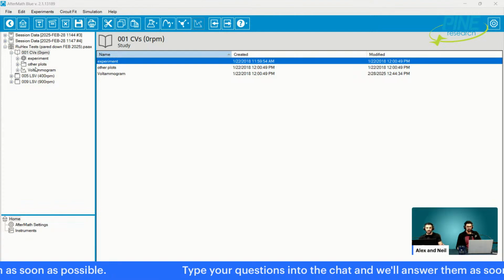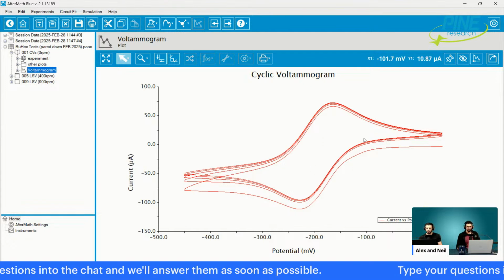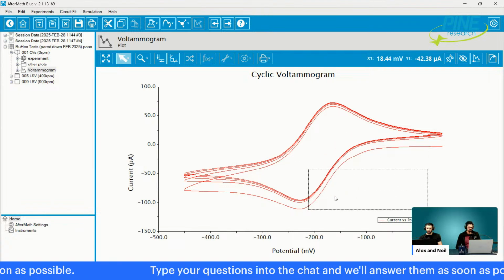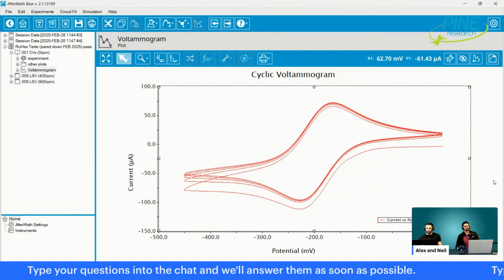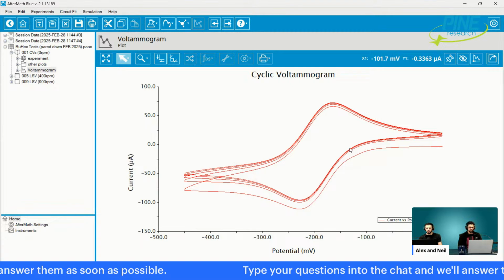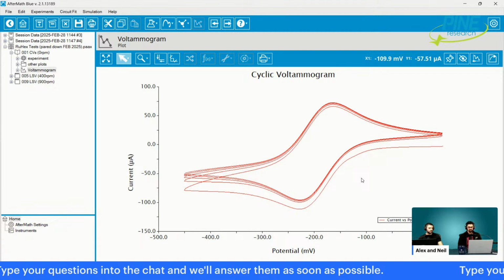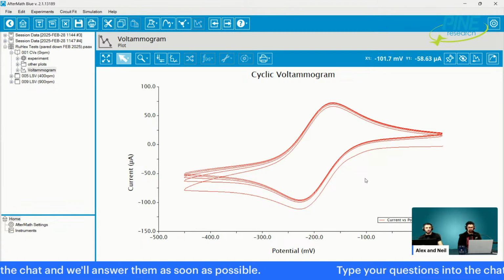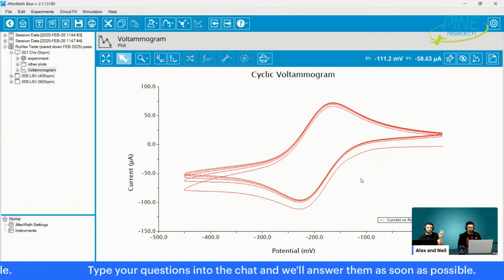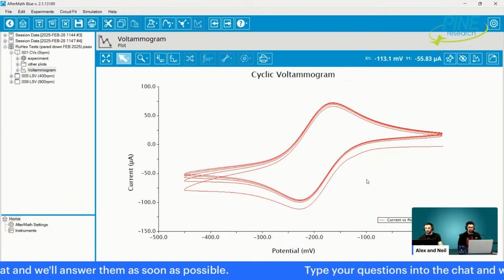AudioFile, I don't have HER data, but I do have a set of voltammetry data here. So hopefully you'll get the gist of this, right? HER data would be kind of like the beginning part of a wave here. Now, to be clear, I'm going to make a Tafel plot. I'll show you just a little bit of how this can be done. And to be clear, on the foot of wave thing we were looking at a little bit ago, I'm not 100% sure if there's more to it. There might be some more kinds of analyses specific to that, FW or whatever, maybe it has its own acronym.